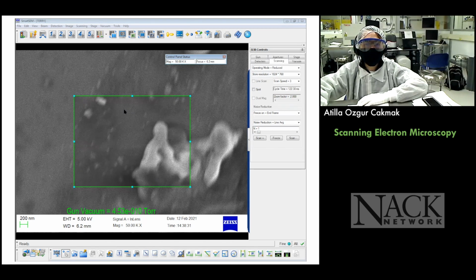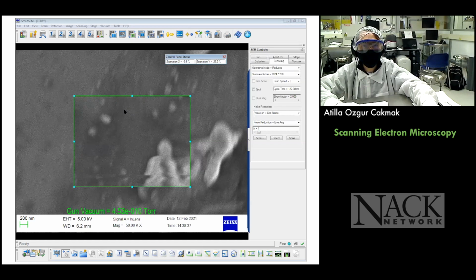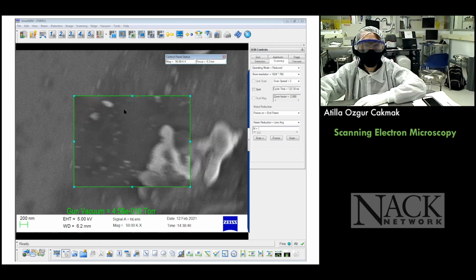Yeah. So when you do the higher magnification, it gets a little bit difficult to focus clearly. So let me work around with some other magical buttons that you guys are not able to see on my end, unfortunately. I'm using stigmation buttons and so on to try to get a clearer image here.